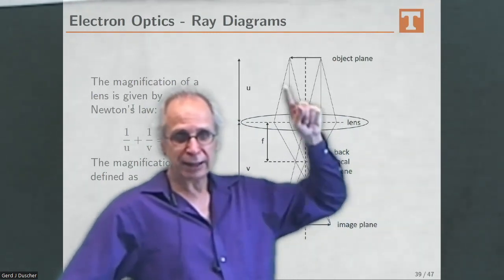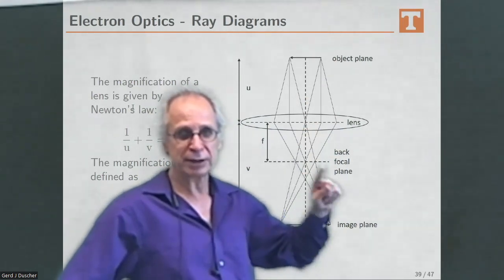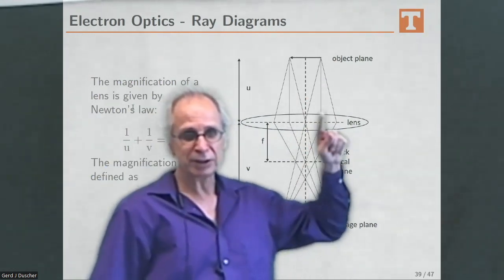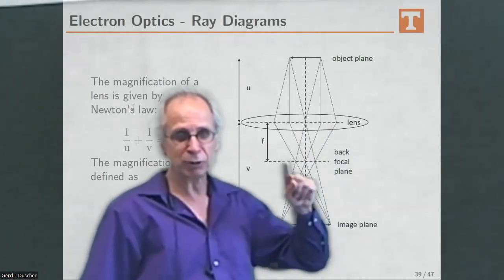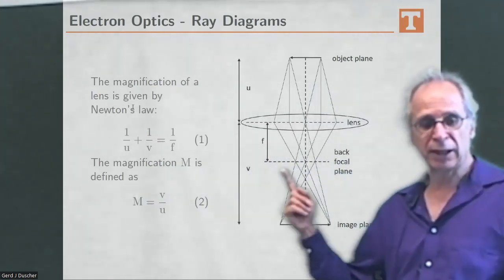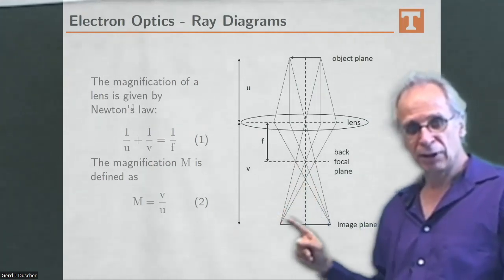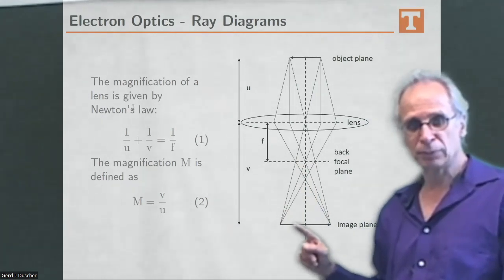If we go in an angle, this will be sorted out in the back focal plane here. So all the angles in this direction meet here, the angles in the other direction meet over here. So this is our back focal plane, and we have momentum-resolved electron information. So that's our diffraction. Then in the image plane, which is a Fourier transformation, we are back in image mode.